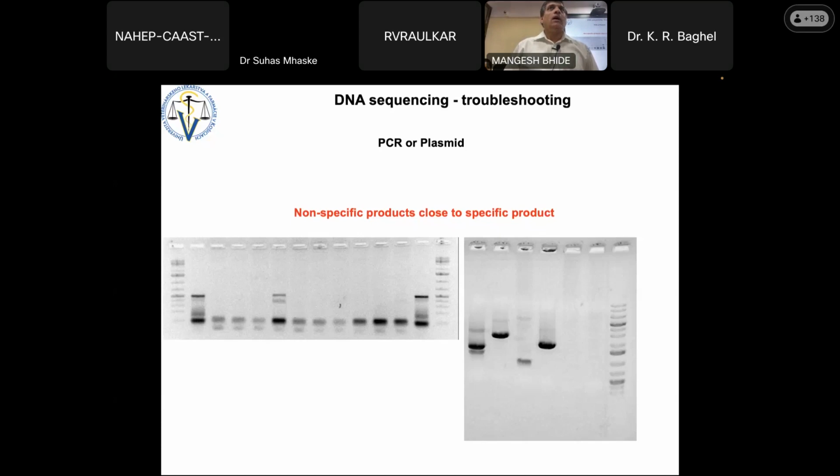Okay, and how to improve the purification is very easy. It's not that difficult at all. And the columns which you use, actually we produce our own columns. I call my diploma students and they prepare their own columns, and they prepare columns for whole year. So we prepare our own column.